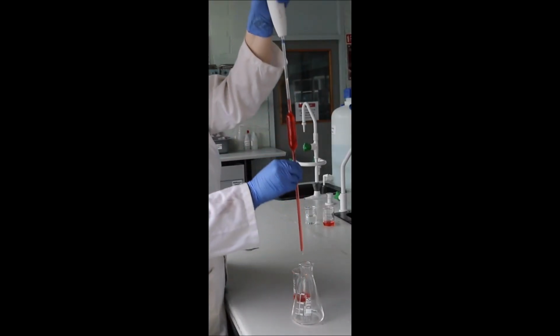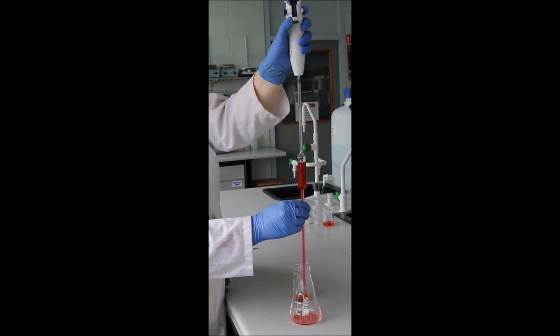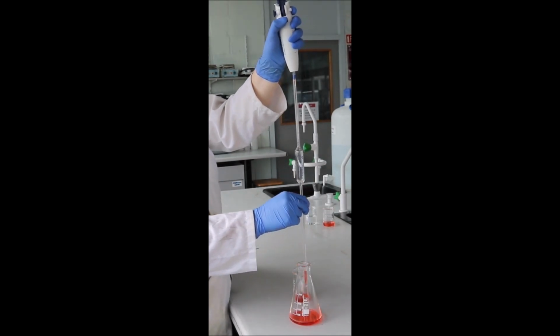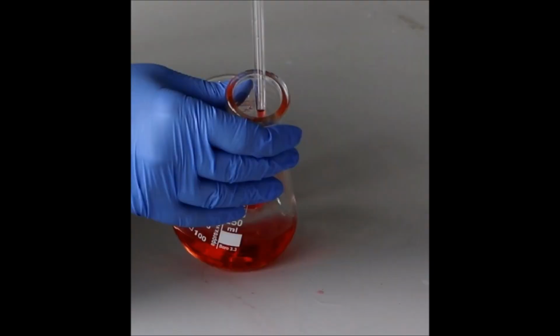I can now empty my pipette into my conical flask by depressing the button under the wheel on my pipette filler. I've sped up my video slightly here just to empty my pipette. I've zoomed in the video here to show you a small amount of liquid still remaining in the bottom of the pipette tip. At this point you should tilt the conical as shown here, touch the tip onto the side of the glass and hold for 10 seconds to drain. A small drop will still remain in the tip, but this is allowed for in the calibration of the pipette, so don't ever force this last drop out.